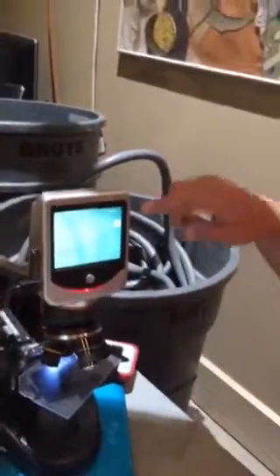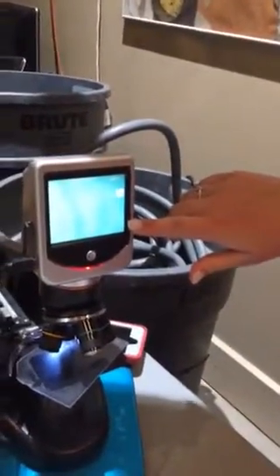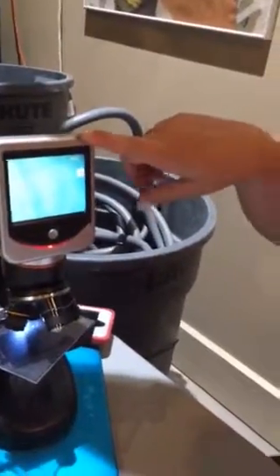Here I used a microscope that allows you to take pictures through the screen here. And this is where I got to see what really happened at the surfaces of the plastic. Through this microscope, I was able to see the cracks that were induced by the degradation of this plastic and where the carbon started to grow.